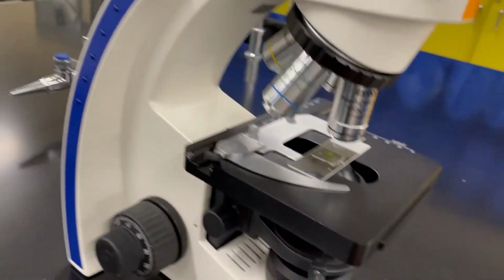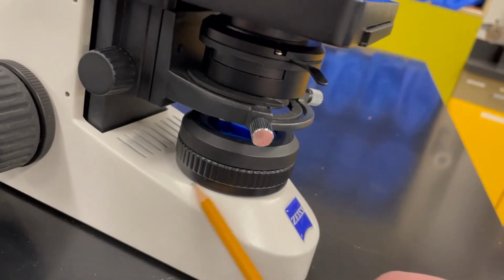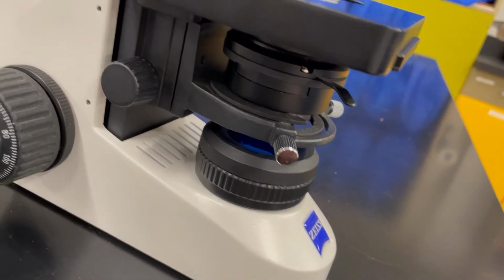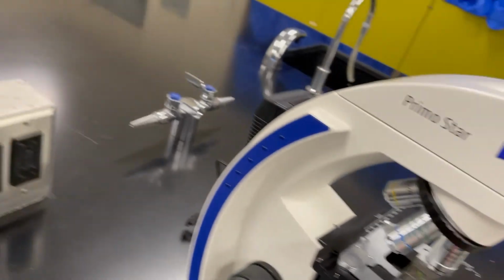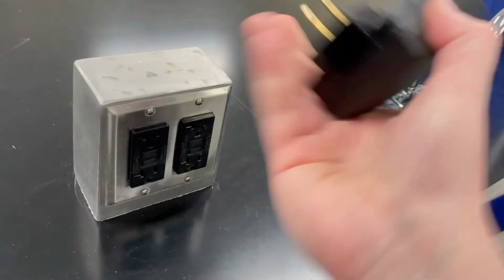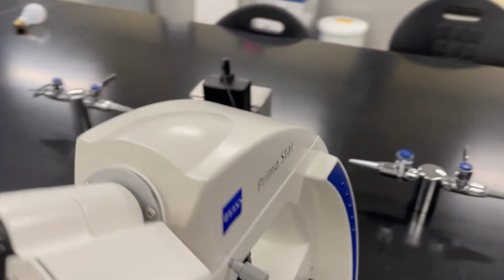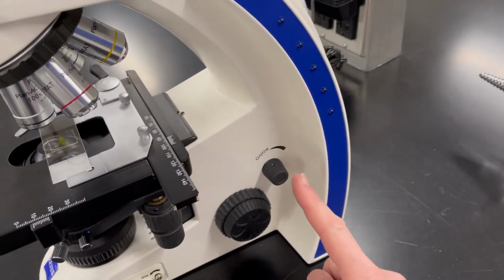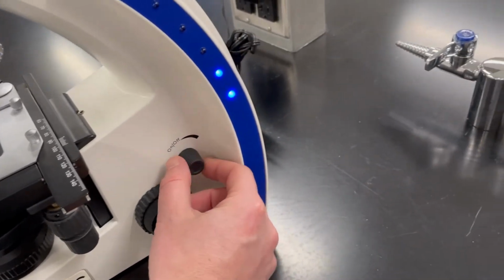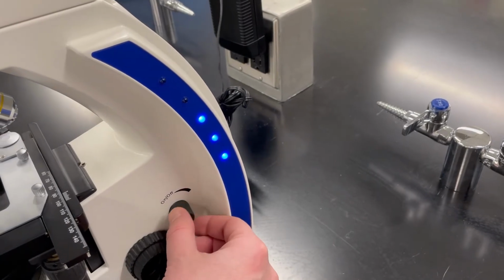So moving down, underneath here, we have the light source is basically in this base here. And in order to turn on the light source, we have to first plug this thing in. So there's a plug at the back. I can plug it in right here. And over on this side is the on-off switch right here. So you can see the on-off switch. These lights turn on and show you what setting it's at. You can turn it down or turn it up.